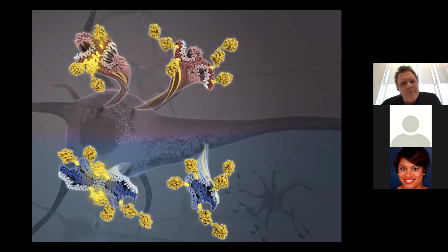Now, today I was also asked to talk about the future of this field and where we might all be headed. One important thing about these endogenous sources is, instead of purifying out the filaments or any other protein complex we're interested in, instead of just solving these structures to high resolution by purifying them out, could we actually look at them in their native environment?